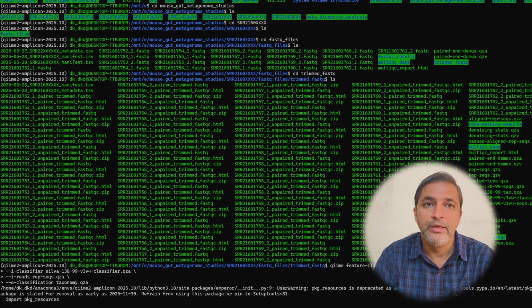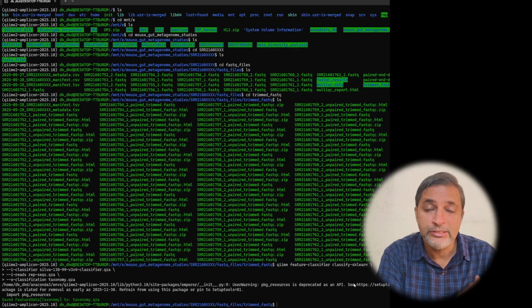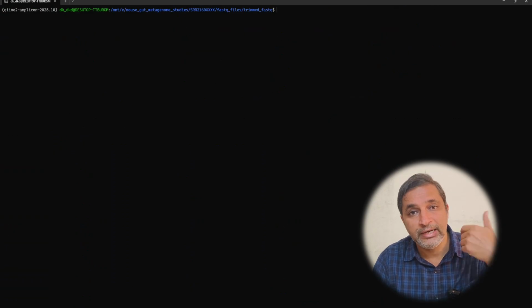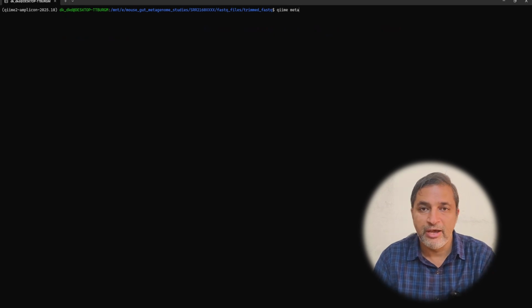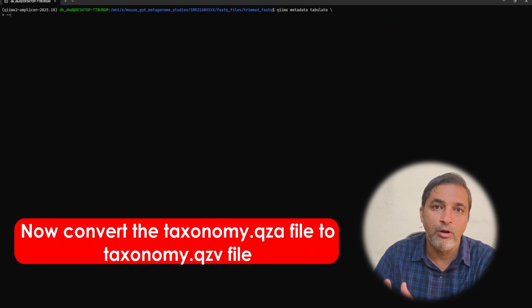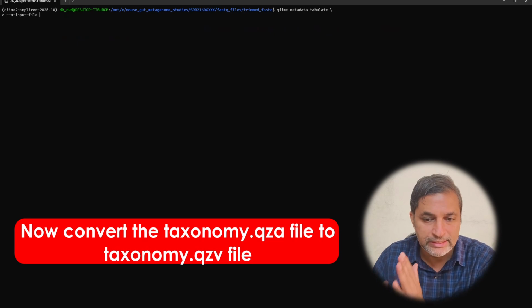One important thing that you must know is that QIIME2 is going to analyze each of your ASVs and compare it against the reference database, and each ASV will be provided a taxonomic hierarchy right from kingdom to the species level, provided that the relevant information is already present for that particular sequence in the reference database.